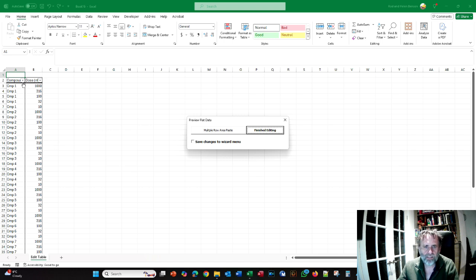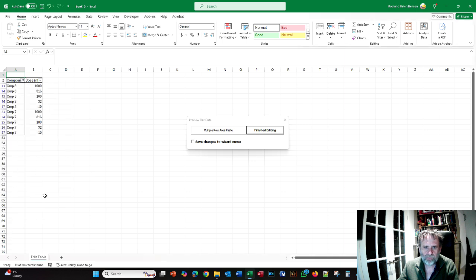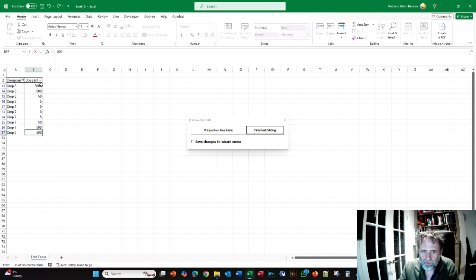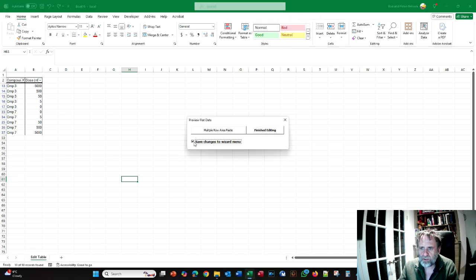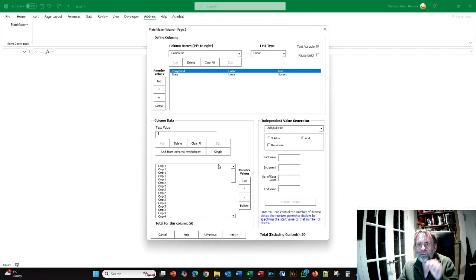So let's do the exercise again. I'm going to select compound 3 and compound 7, and I'm going to enter my, remember it's 5,000, 500, 50, 5, 0, and 0, and 5, and 50, and 500, and 5,000, but this time I'm going to tick Save Changes to Wizard menu. I click Finish Editing, and now you can see it returns me to page 2.